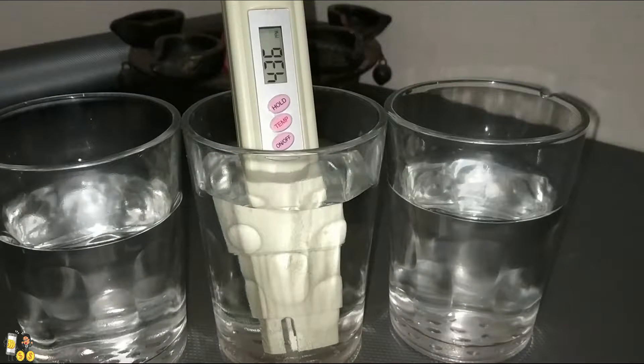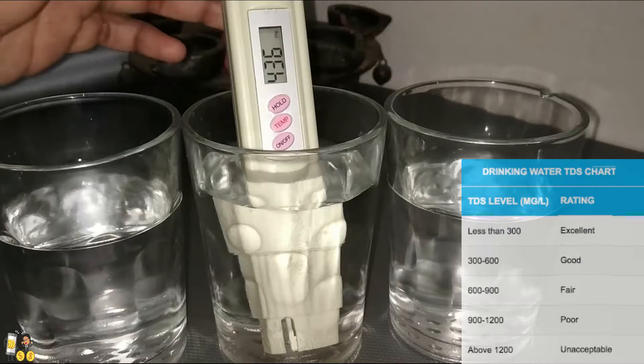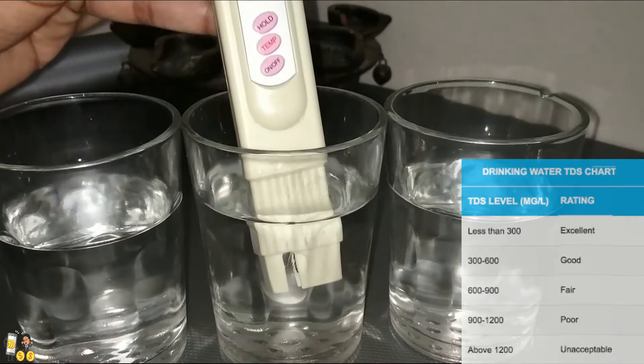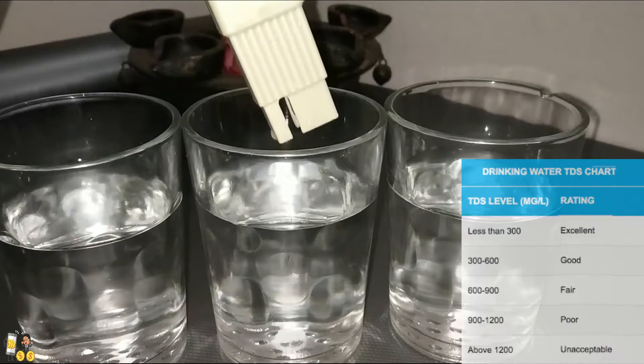That is quite close — we need to consume water that is under 500 PPM as per the WHO. If your water levels are under 500 PPM, you can consume it and it is good for your health. If you have less than 300 or 200 PPM, then the water is perfect and soft for drinking.